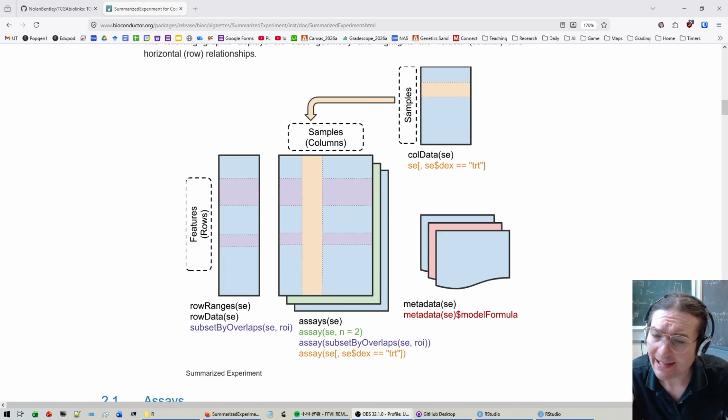Similarly, the clinical data, which is going to describe each of the samples that we're analyzing, is stored in a section called colData, for column data, describing that this actually corresponds to the columns of this middle section. Just as this was rowData or rowRanges, describing the information going across the rows of this object. However, in colData, what are the columns over here is actually described across the rows of colData. Kind of a weird transposition, but if you think about it, that kind of makes sense.